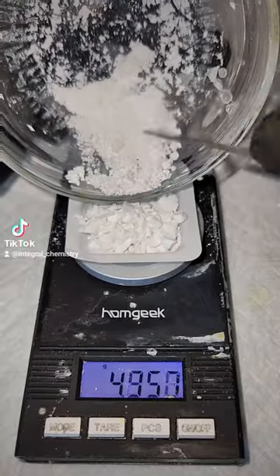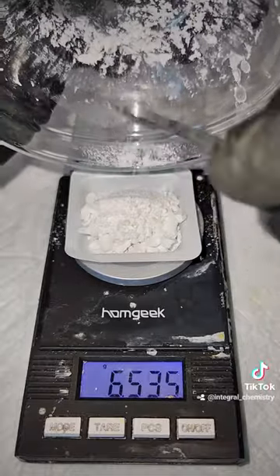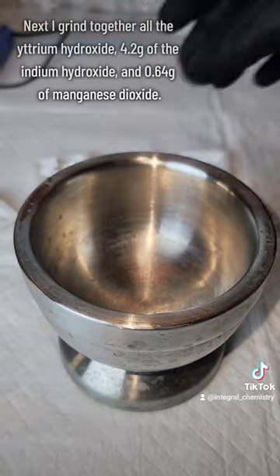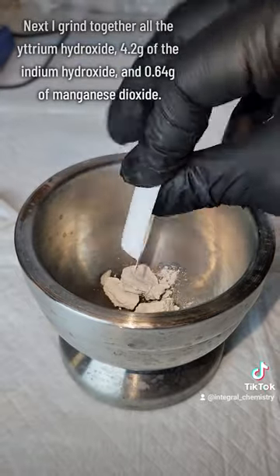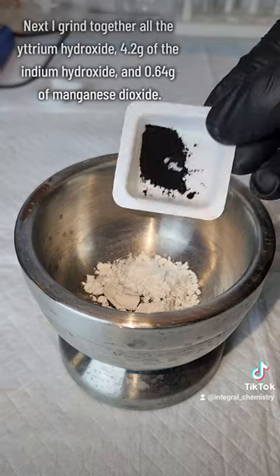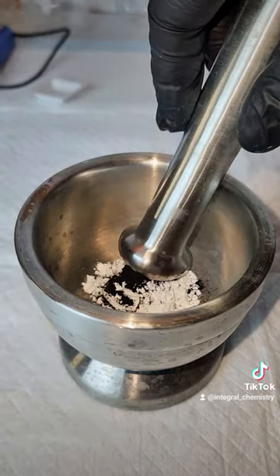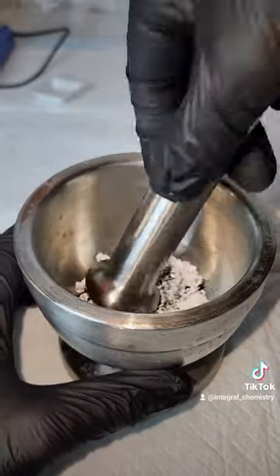The next step is to grab a mortar and pestle and grind together all of the yttrium hydroxide alongside 4.2 grams of the indium hydroxide and 0.64 grams of manganese dioxide. For the reaction to get a good yield, these need to be ground together as thoroughly as possible, and I keep grinding until I cannot feel any more grit whatsoever.